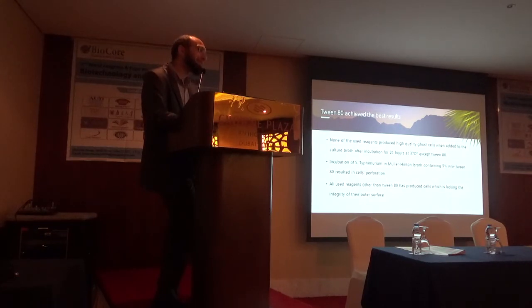But although no Tween 80 concentration inhibits growth, we have seen that Tween 80 achieved the best results. How? None of the used reagents produce high-quality bacterial ghosts when added to the culture broth after incubation of 24 hours, except Tween 80. Incubation of Salmonella typhimurium in Mueller Hinton broth containing 5% Tween 80 results in cell perforation.